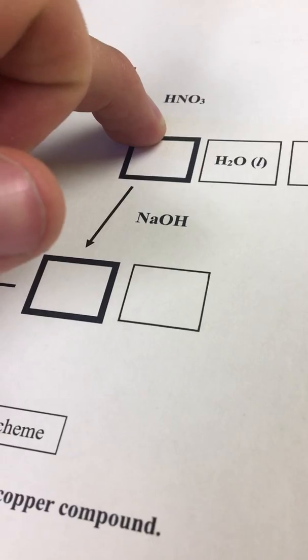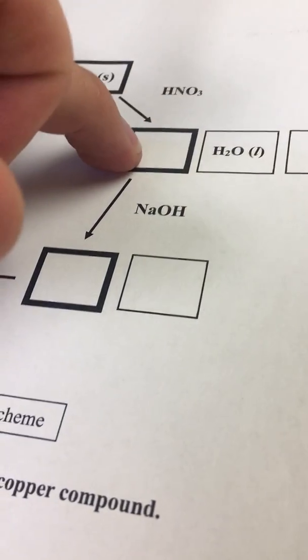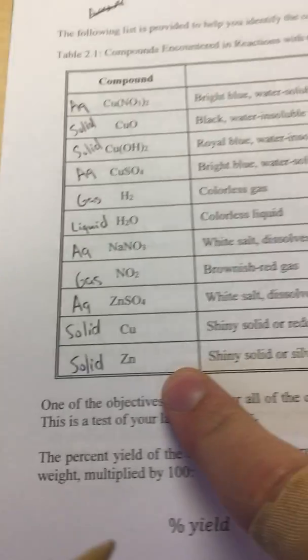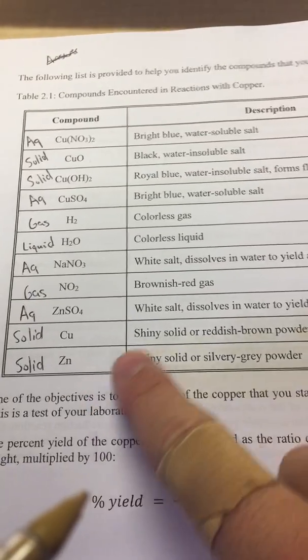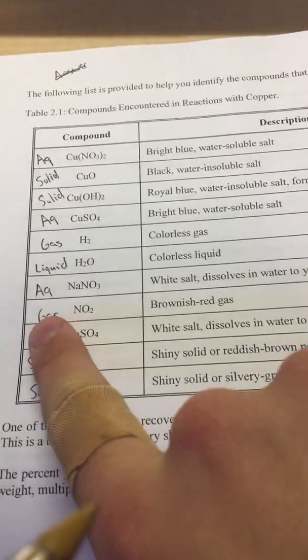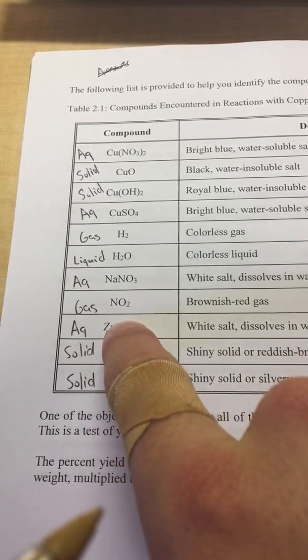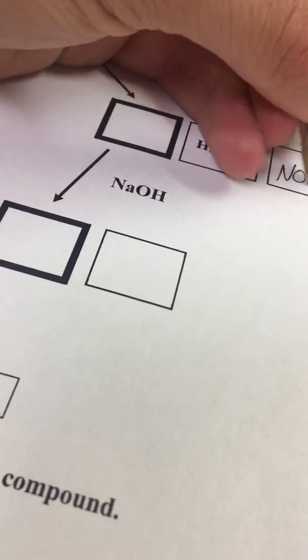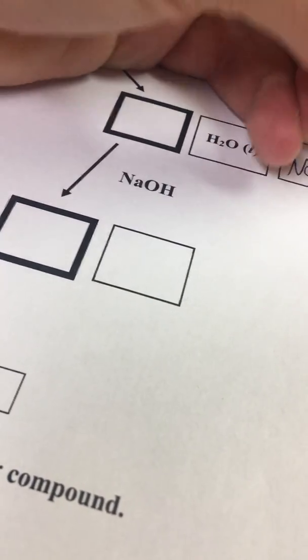The reaction of this was a brownish red gas, which, if we look over here, it was a brownish red gas, which was NO2. So in this box right here, it would be NO2, and that's a gas.